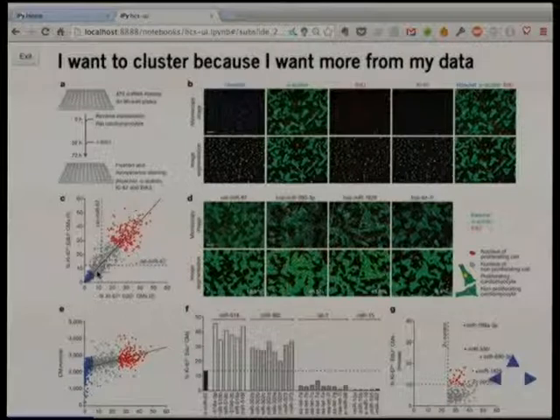But obviously, there can be a lot more going on in your pictures. So cells can take all forms of shapes, independent of the density. So essentially, you're spending $250,000 on a screen, and then you're getting this one number out of it, maybe a list of 100 genes that look interesting, and that's it. And as I said, it's actually very valuable. Great drugs. There's been a lot of success in drug discovery, but there's a lot more information in that data that people aren't using.